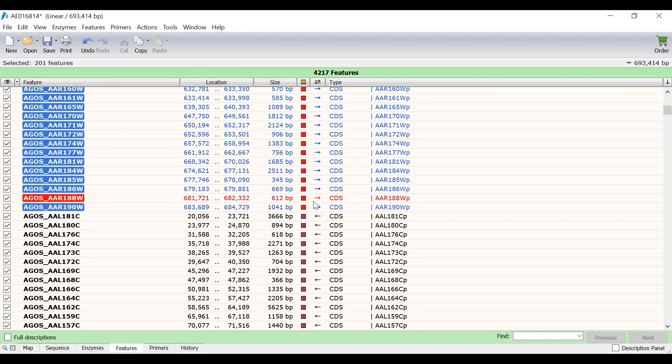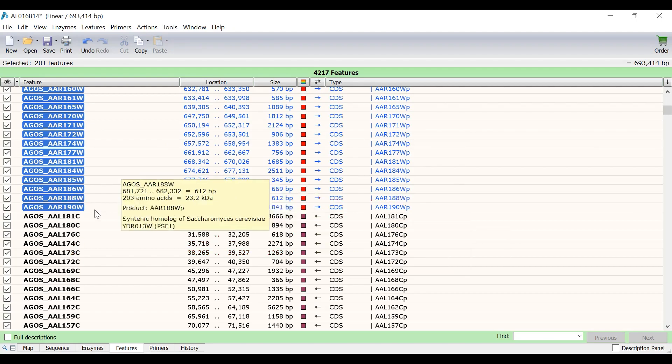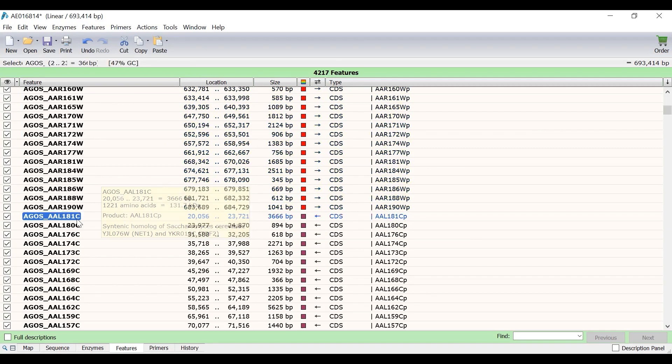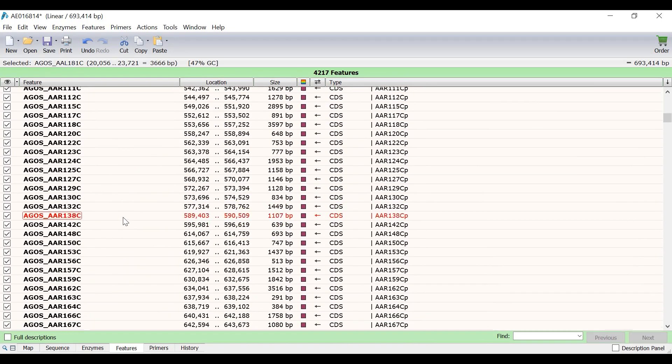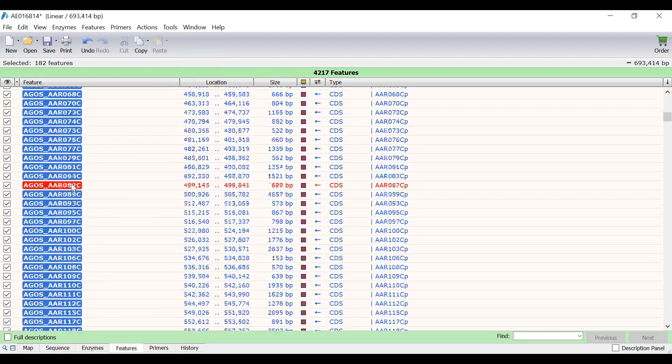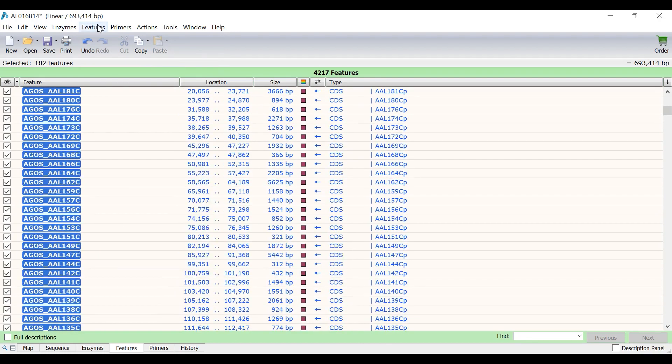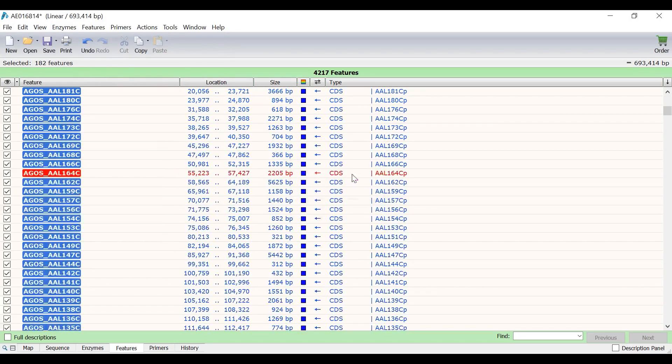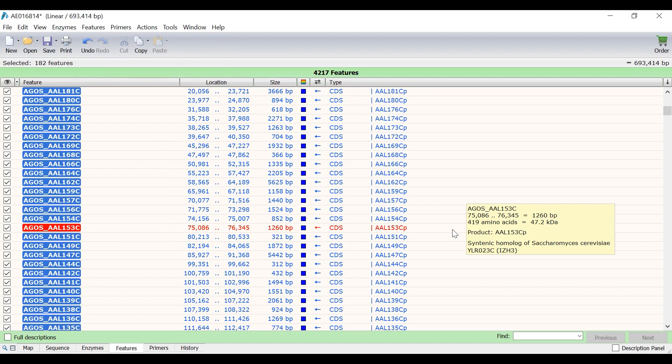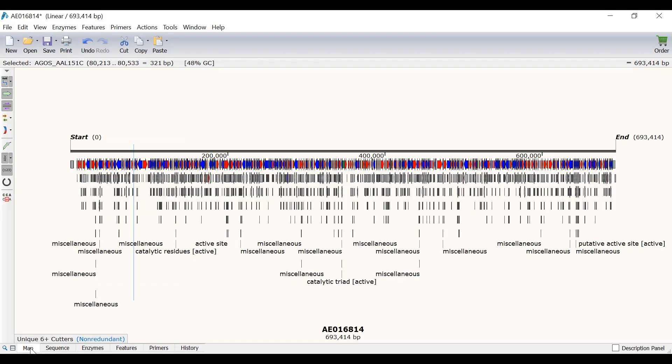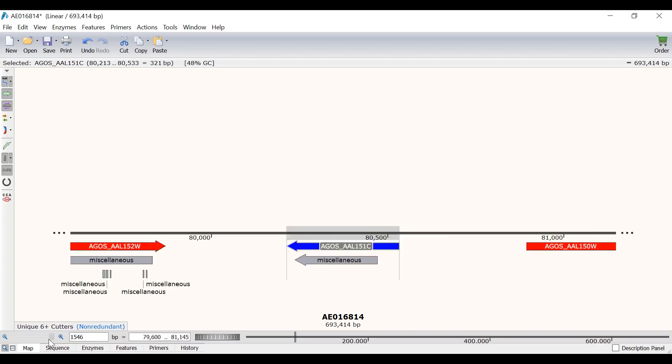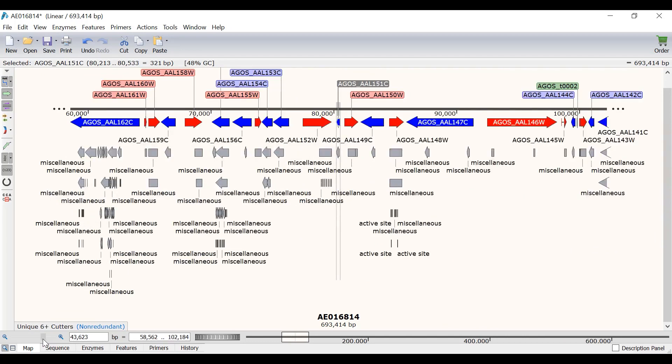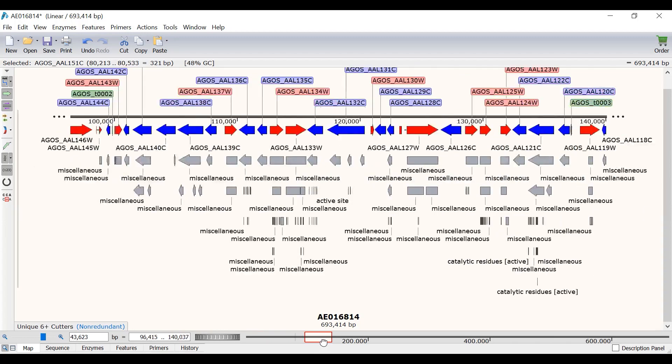Next, I will select all of the coding sequences in the reverse direction by clicking on the first entry and shift clicking on the last. Again, I will go to Features, Feature Color and this time select Blue. Now, if I go to Map View, I can see how these colour changes have changed the appearance of the features. By using the zoom tools at the bottom, I can zoom in and scroll around the chromosome to easily identify the coding sequences based on their directionality.